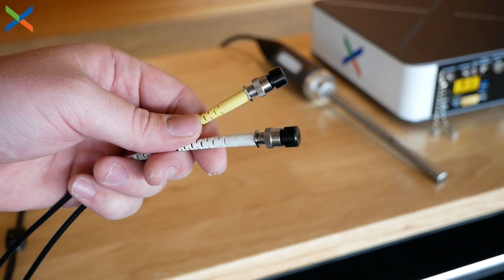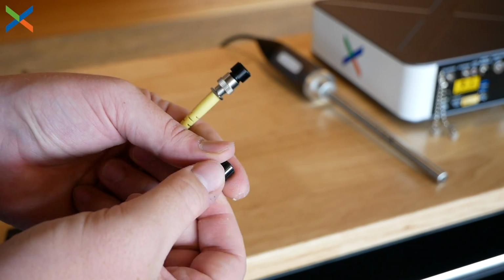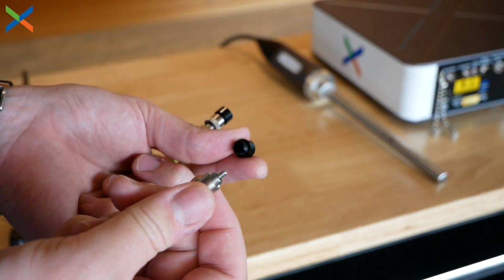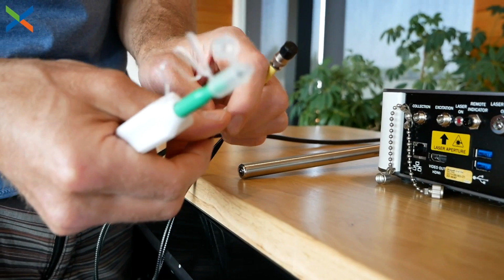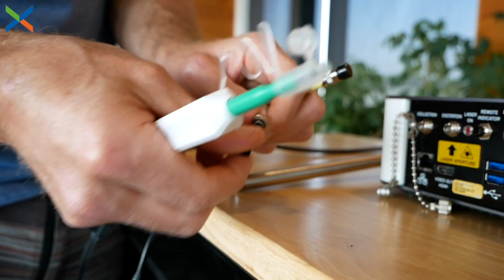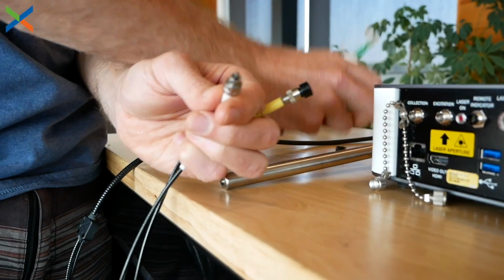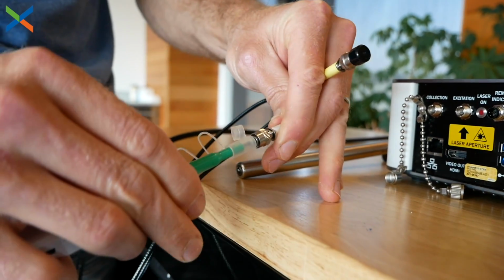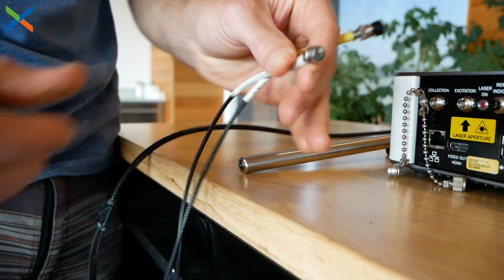Due to the way our Raman system works, it's incredibly important to make sure that your fiber connections are clean and secure. To ensure the best connection, we always recommend using the included fiber cleaning tool on the fiber ends as well as the device's connection ports. Simply remove the cap, insert and press the tip of the fiber cable until you hear a click, and repeat 2 to 3 times per use.